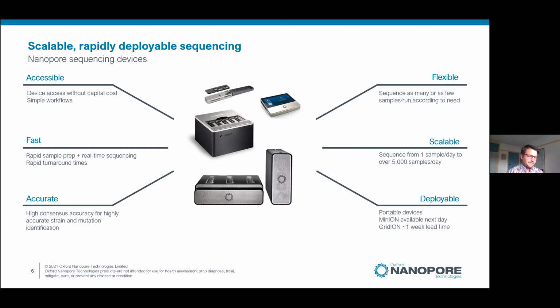A GridION, which is effectively five MinIONs on top of a supercomputer, delivers 5 times the throughput you get from a single MinION. And then the PromethION, which is either 24 or 48 formats, where each individual flow cell can be run on its own, and it can be run in a batching format. It can be run debatched. It can be run however you want it to be. So it enables people to be more flexible with their sampling.